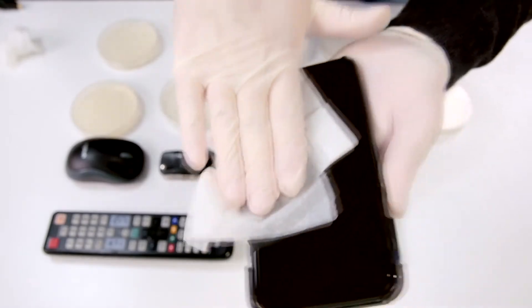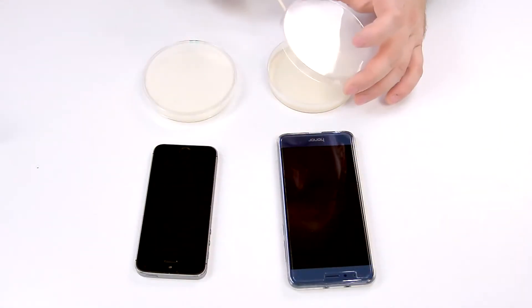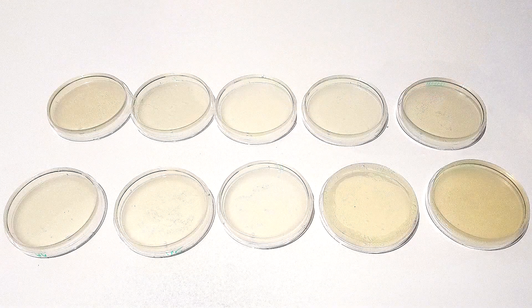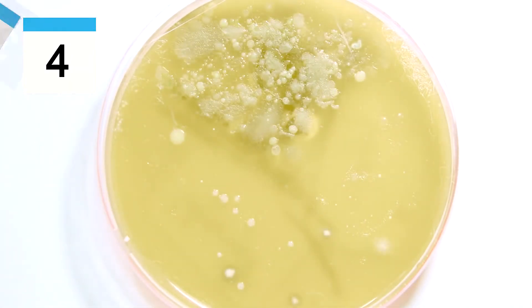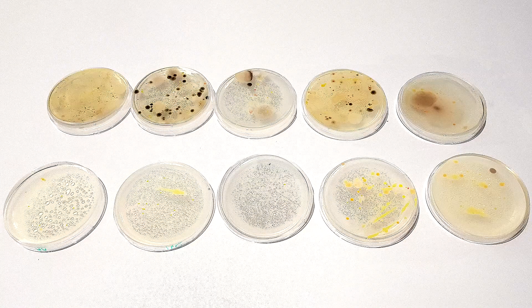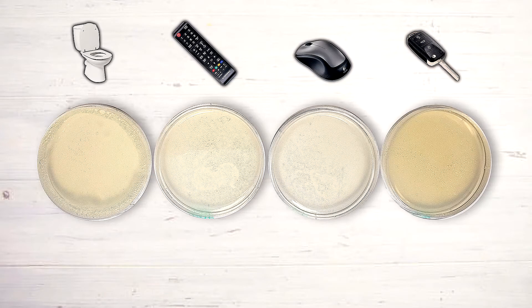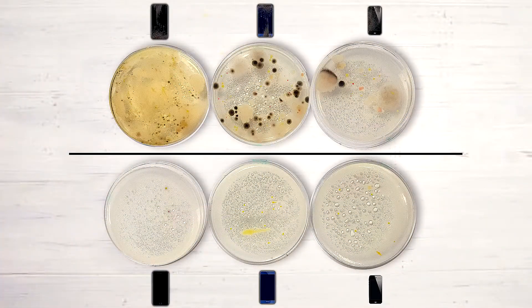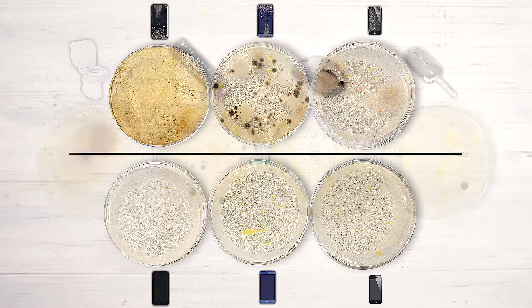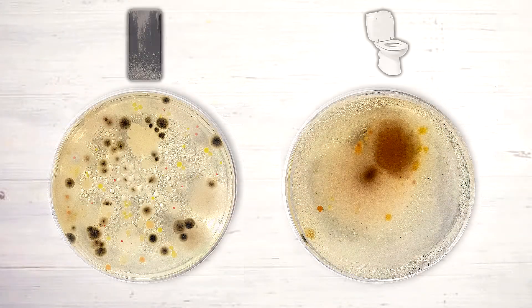Back in the lab, I took more samples from the now-cleaned phones, again using a different swab stick each time. I let the bacteria grow for 10 days, and these are the gross results — pretty surprising. All three phones were full of bacteria before cleaning; one of them was actually dirtier than a toilet bowl. The remote control and the computer mouse were also gross, so clean those as well.